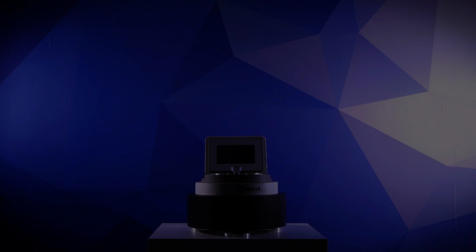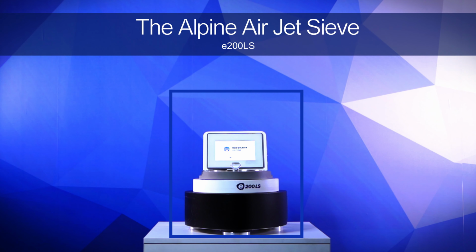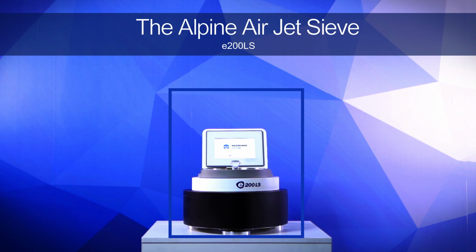Here at WS Tyler, we understand the importance of having a particle analysis system that's tailored to your specific needs, and we have the know-how to point you in the right direction. To give you a better understanding of the software that controls the Alpine, we're going to be reviewing the software levels, their cost, and what you can expect if you switch levels. Let's get started.